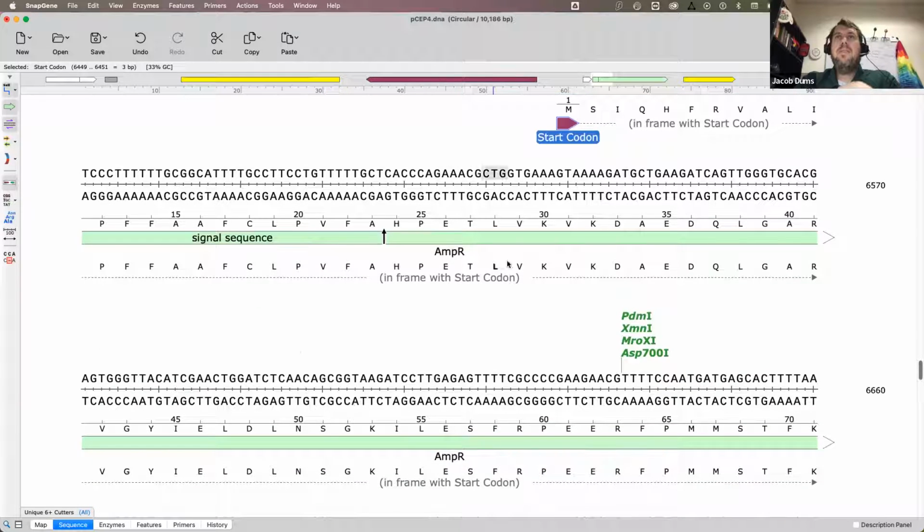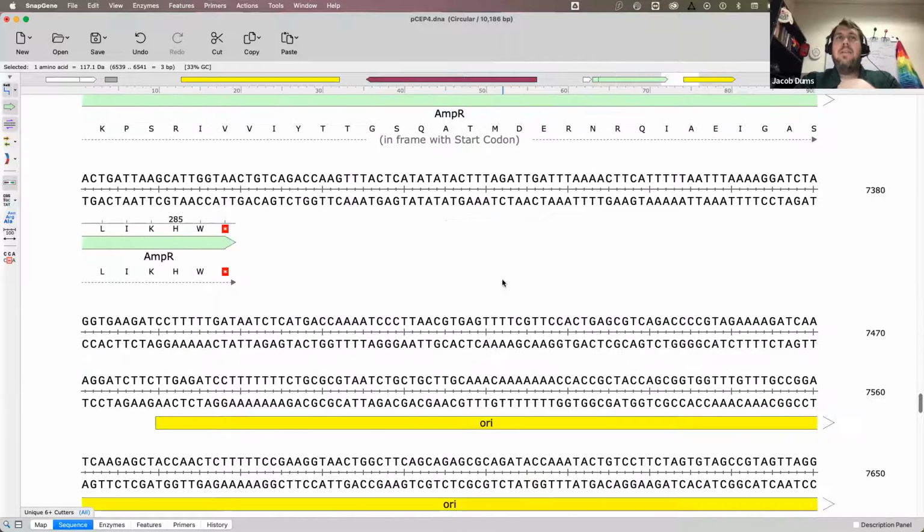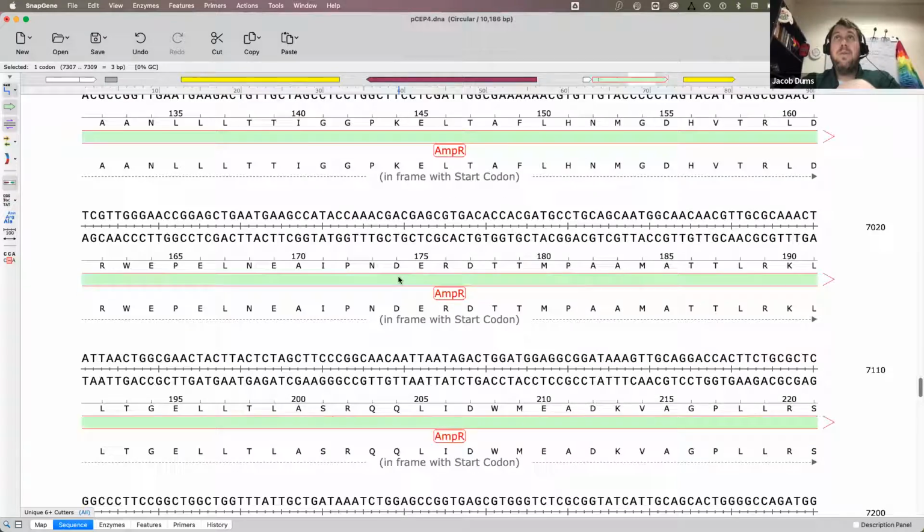This is the correct set of codons to be using. And then when it stops and finds a stop codon, it will immediately bail and say, oh, if this actually starts translating here, this is where it's going to stop. Because I used the correct stop codon, of course it stops right at the end of the gene sequence.